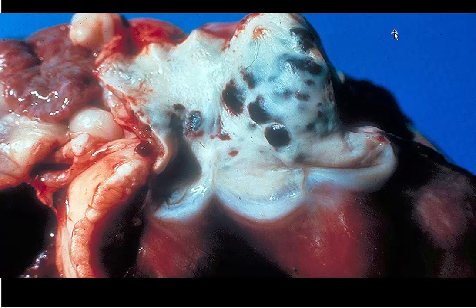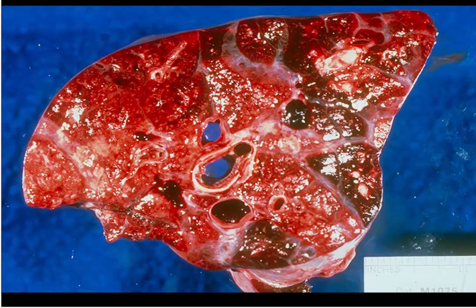Okay. Slide number 4 is tissue from a pig. Can you give me a morphologic diagnosis and the cause of this lesion?